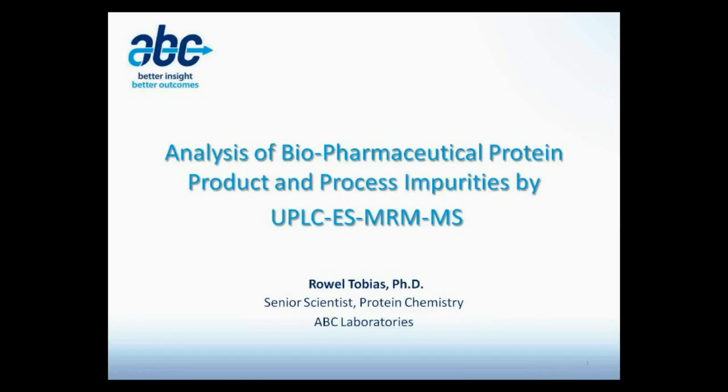basically the MRM determines the quantitation based on differences in mass, which I'm going to talk about on the next few slides. Basically, if we know the mass, we can design a method to target specifically a product impurity, for example, an isoform or variant, or a process impurity which is in your product if you wanted to monitor it during the manufacturing process.